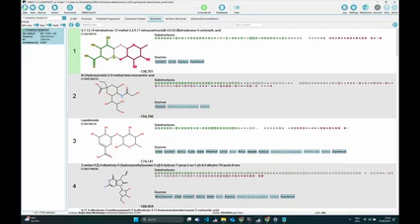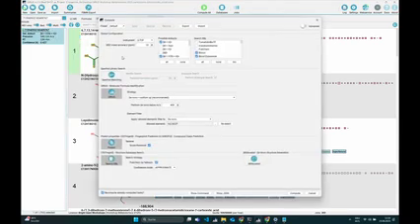And what we can do in this case, if we can now actually perform this de novo search, we can now compute de novo structures with MSNovelist, and we will try to show this here now live. We'll just right-click on this compound, and the first option you have is this compute option. If you click on this, we now have our compute panel again. It looks a little bit different because we are now just doing computations for a single compound, so you don't have a Zodiac button here, for example.